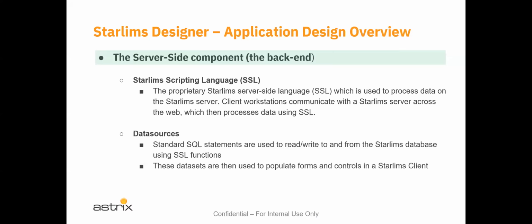So data sources in STARLIMS really consist of standard SQL statements, those that you would execute in Microsoft SQL or Oracle. And we do standard select statements, and we do standard inserts, and we do updates and deletions, as it were.